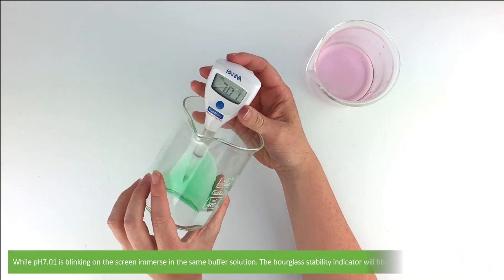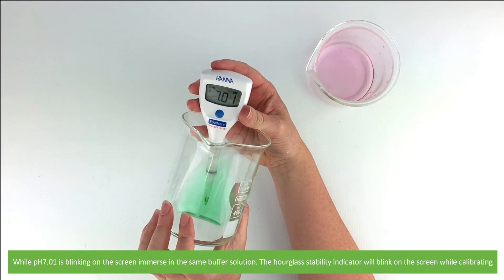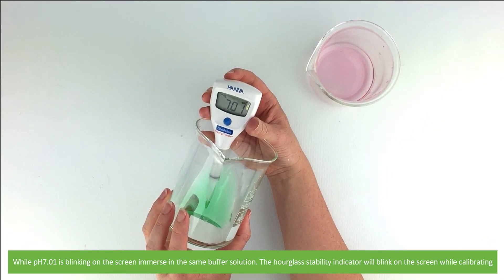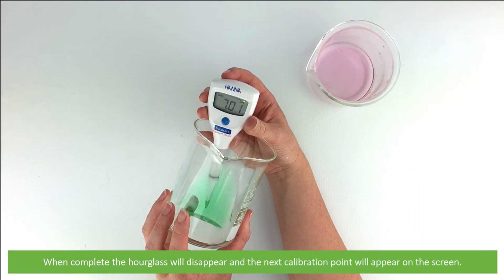While PH7.01 is blinking on the screen, immerse into the same buffer solution. The hourglass stability indicator will blink on the screen while calibrating. When complete, the hourglass will disappear and the next calibration point will appear on the screen.